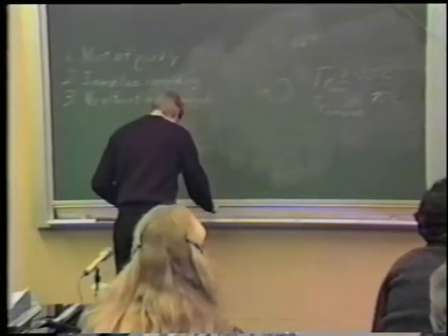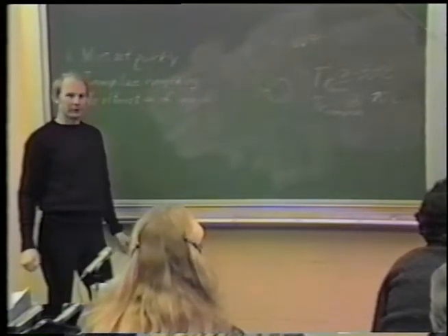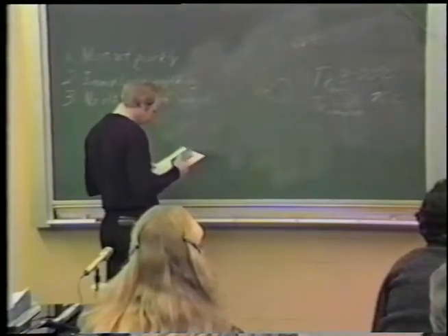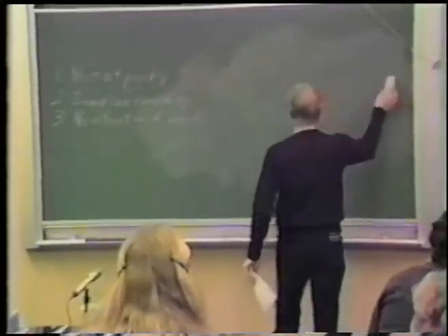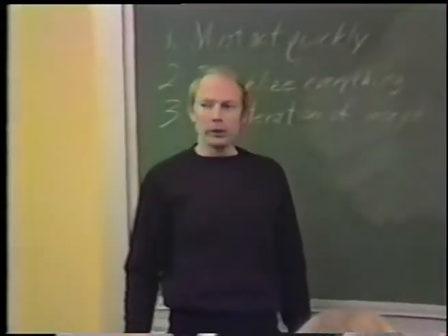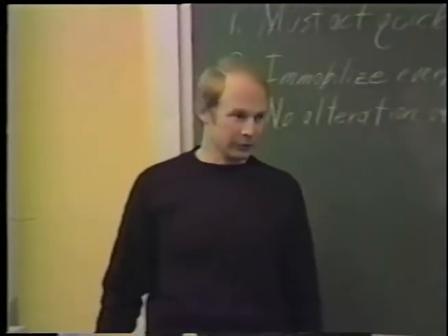Now, what are the artifacts associated with ultrarapid freezing? We've talked about the artifacts that are associated with chemical fixation techniques. The most common artifact seen in an ultra-rapidly frozen sample is that it's not ultra-rapidly frozen. There are ice crystals. Now, when ice crystals grow, they tend to exclude all the solutes.